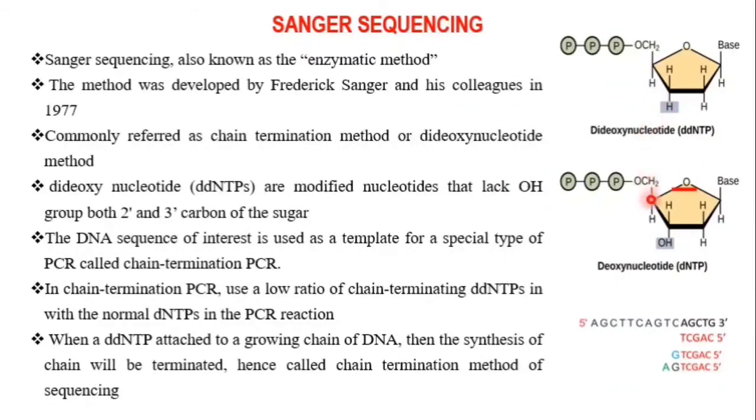Here you can see, for example, this is our template DNA and this is the primer. Then we add a mixture of normal deoxynucleotides and dideoxynucleotides.